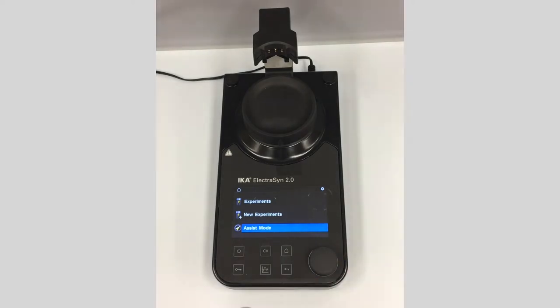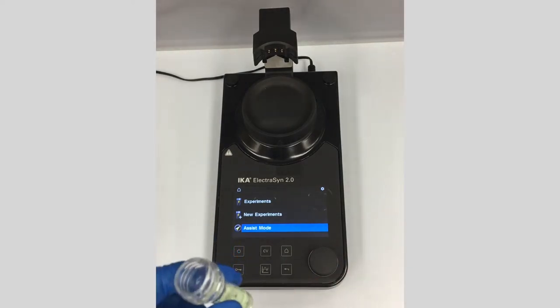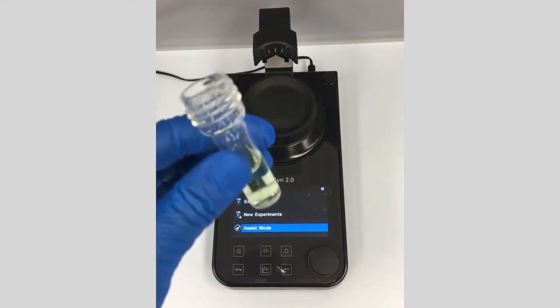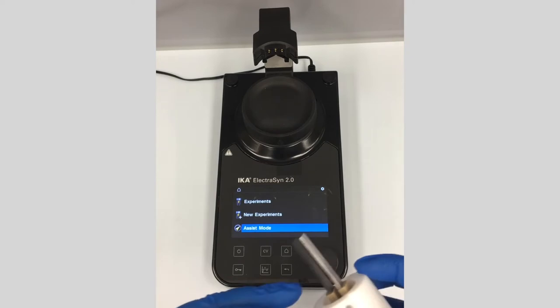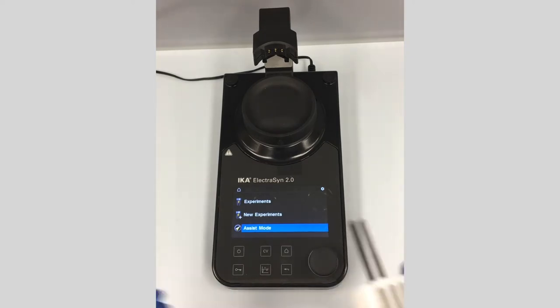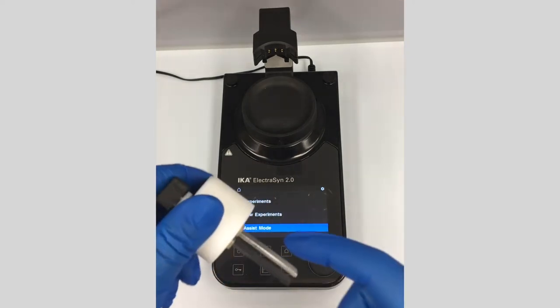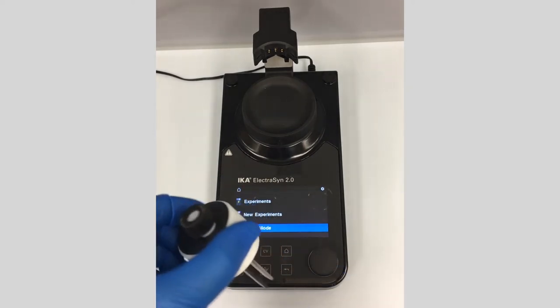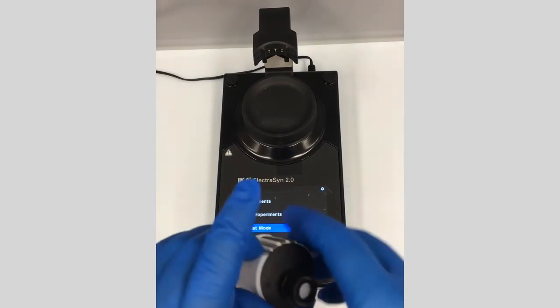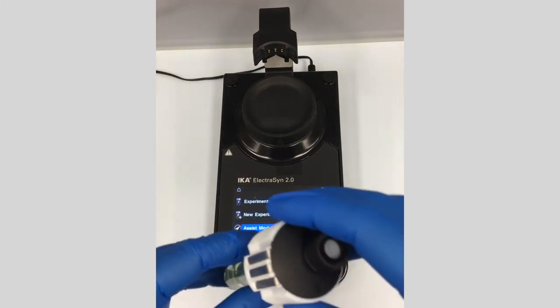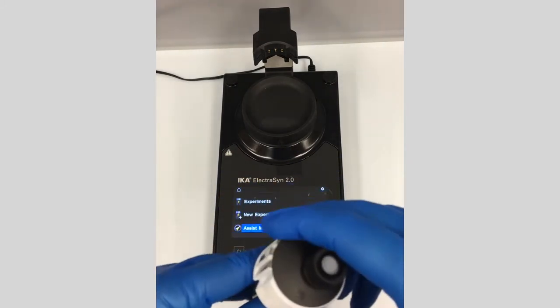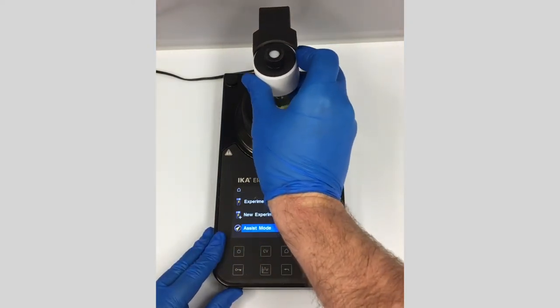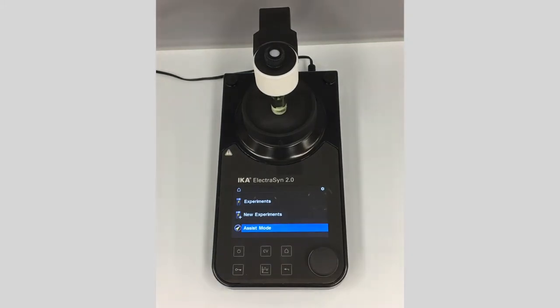So first today we're going to run Yu Kawamata's Buchwald amination using electrochemistry with nickel. I have the solution all mixed up here with a stir bar. I'm going to use a stainless steel cathode for the counter electrode and a carbon anode for the working electrode. I'll just fit this together and click it right in there.